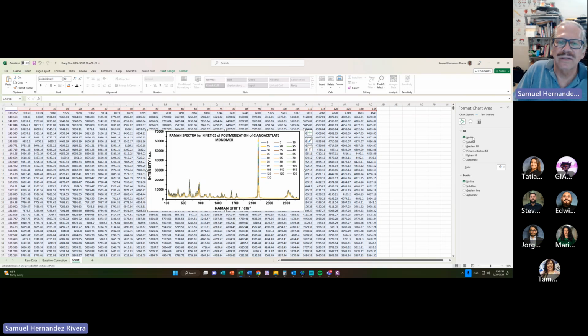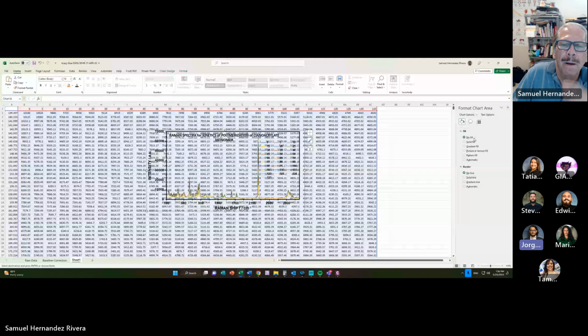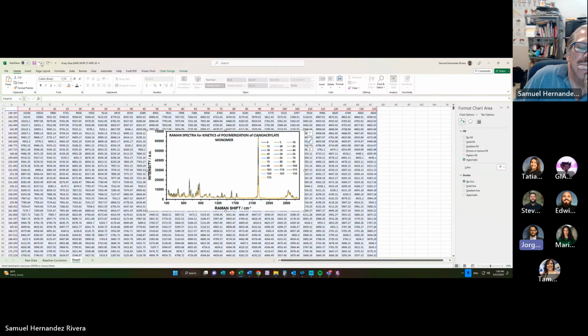Profe, yes. About the labels of the spectra, depending on how many spectra we have, the names are going to be less or greater. So the position of those labels are going to depend on the size, or always are going to be in the right corner? No, it doesn't matter. You can put them anywhere, but within the graph, not outside the graph, okay?